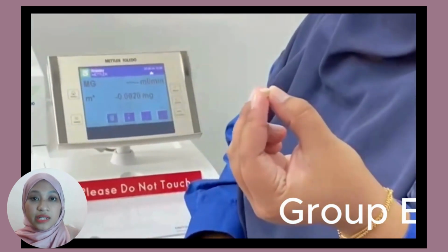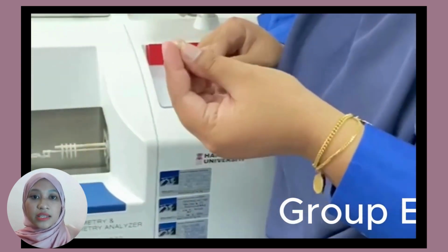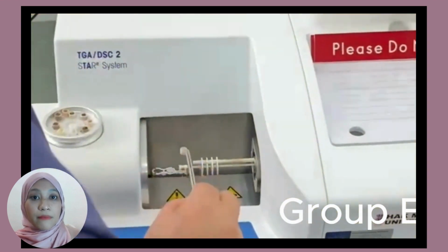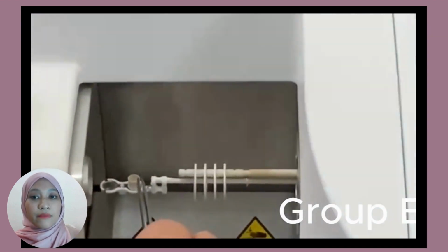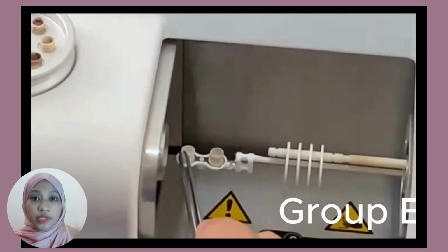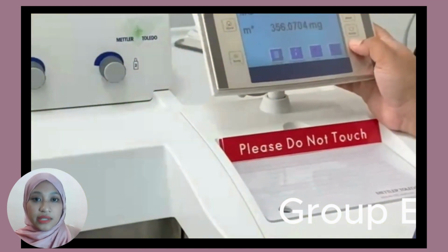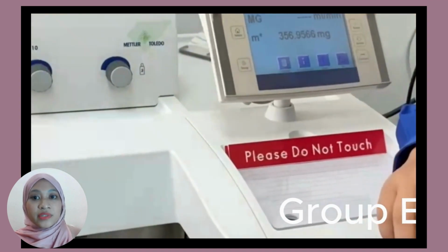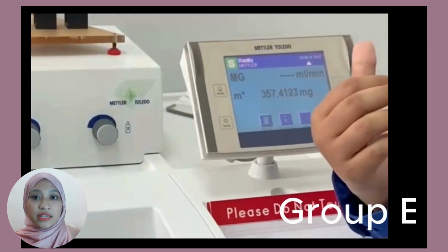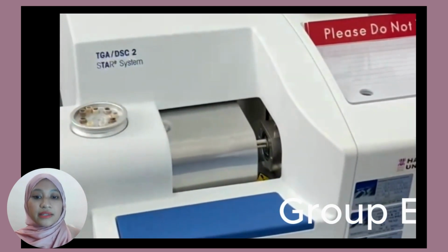To get ready for analysis, shut the furnace. Set the heating rate to 15 degrees Celsius each minute. Set the nitrogen gas flow rate to 25 ml per minute to create an inert environment. Decide on the experiment temperature range, which should start at 25 degrees Celsius and reach almost 800 degrees Celsius. The TGA analysis software on a computer will plot a graph showing the change in sample mass as a function of temperature. This graph is used as the data.